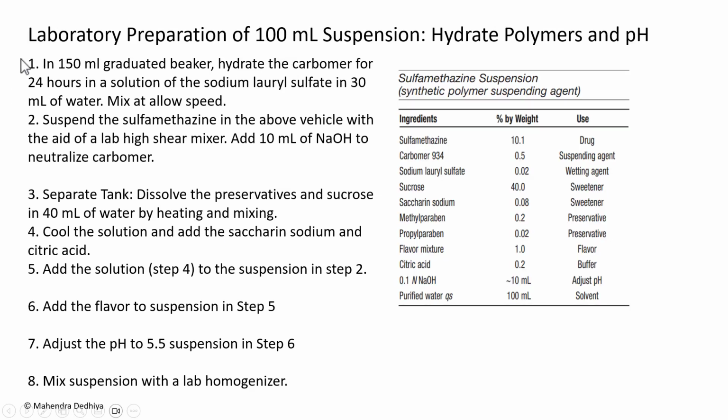Laboratory preparation of 100 ml of the same drug, sulfamethazine. In this case, the polymer is carbomer 934. And as pointed out earlier, carbomer 934 requires a neutralization step.